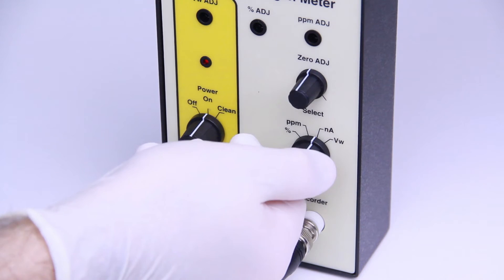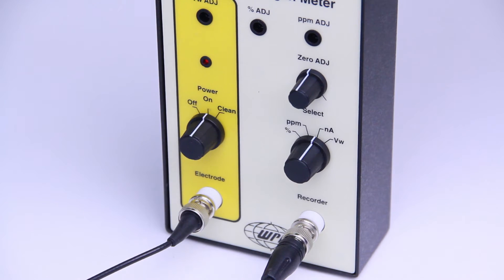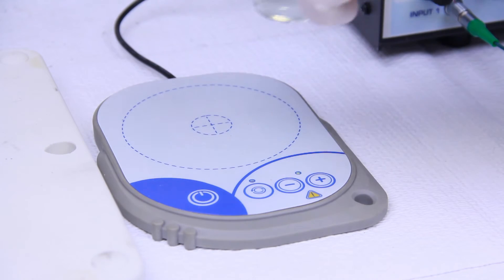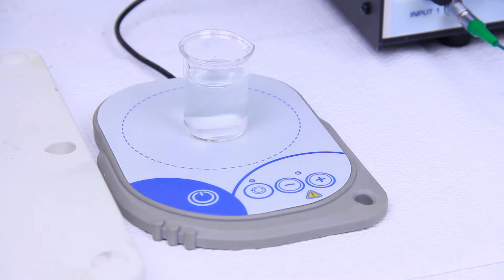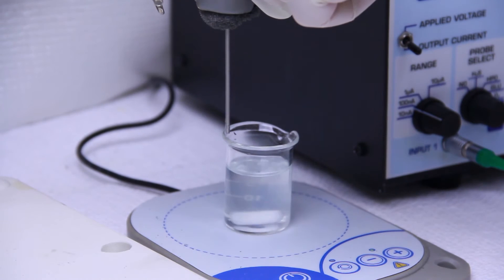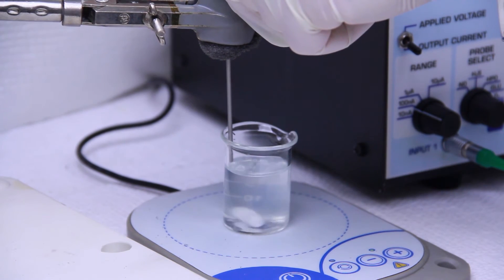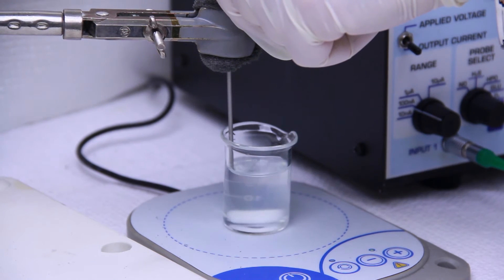Because the sensors are identical, the calibration procedure is the same. Fill a small vial with about 20 milliliters of 0.1 molar PBS solution and place it on a magnetic stirrer, stirring gently. Lower the sensor carefully into the solution to avoid contact with the magnetic stirrer.